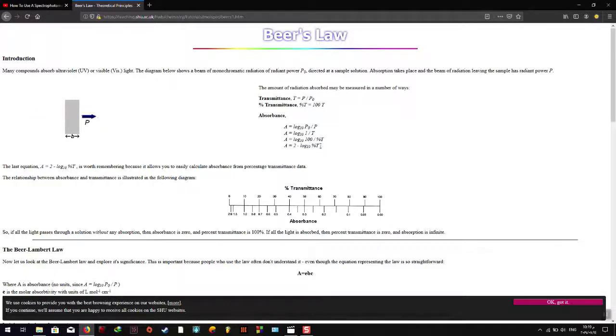So when we calculate the transmittance, the device will use this formula. If we switch it to absorbance, it will calculate this formula by using the result from the first formula. Even if we calculate the absorbance of the analyte, we will not get the concentration directly. We need another sample, called the standard, whose concentration was already calculated. When we measure the absorbance of the standard and the absorbance of this sample, we could plot a curve and, by cross multiplication, we will have only one unknown, the concentration.